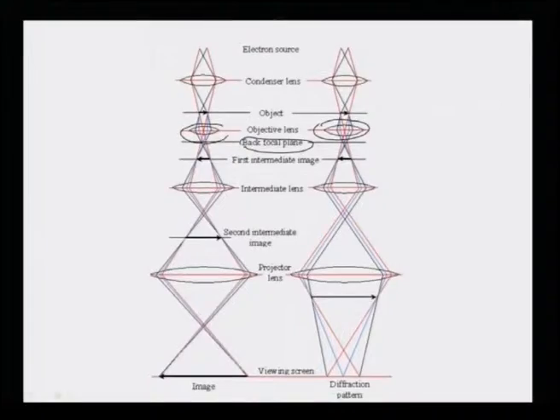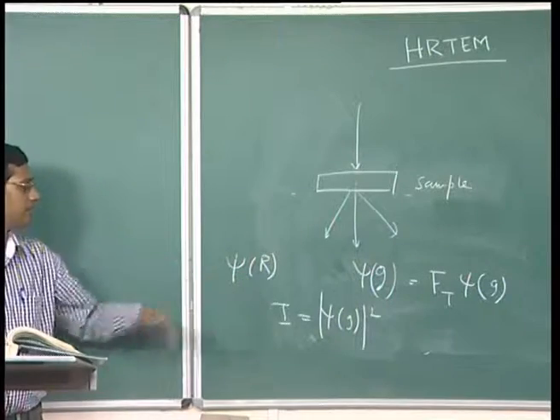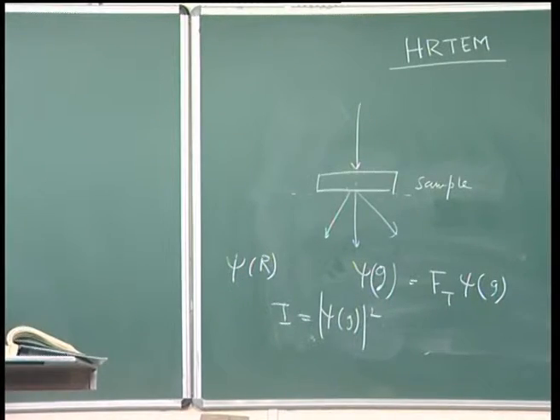Lattice fringe is nothing but the inverse Fourier transformation, which reconstructs the object function psi(r) in the image plane. Therefore, by just looking at the camera picture and comparing it with the electron microscope, one can simply understand how these basic things actually happen in the electron microscope.